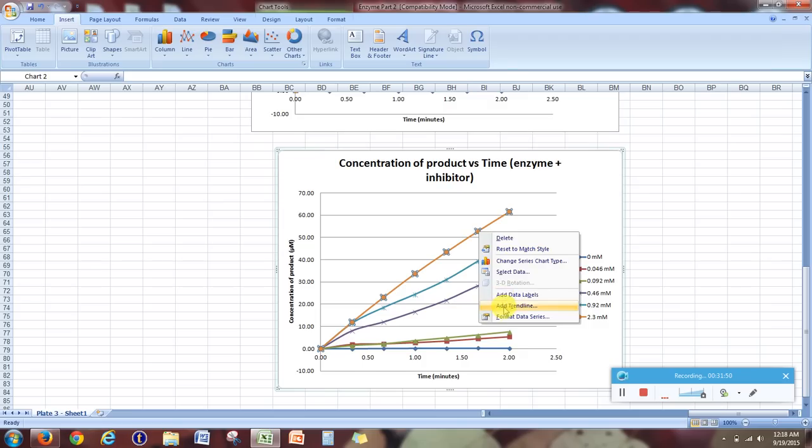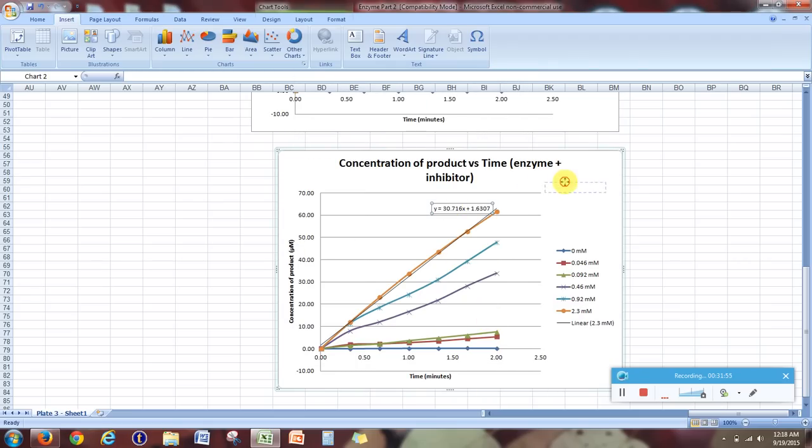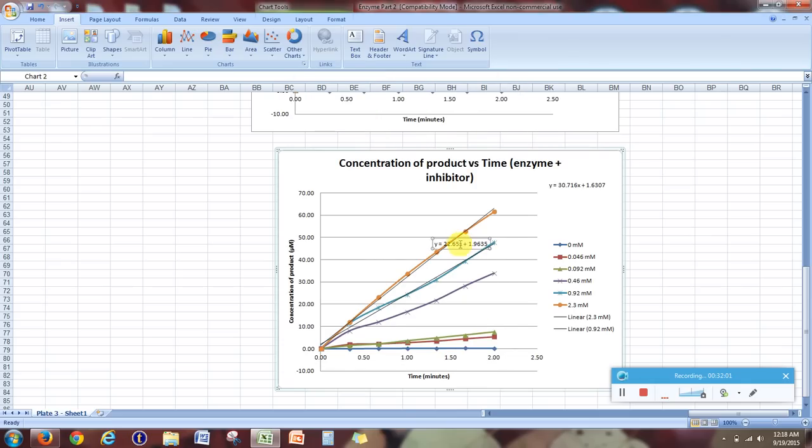Just want to make sure that you remember the difference between those two, because what we're going to do is make the Michaelis-Menten plot for your row B data, and then we'll also do it for your row C data, although you may or may not have to include that in your lab report. It depends on your TA, what he or she wants.